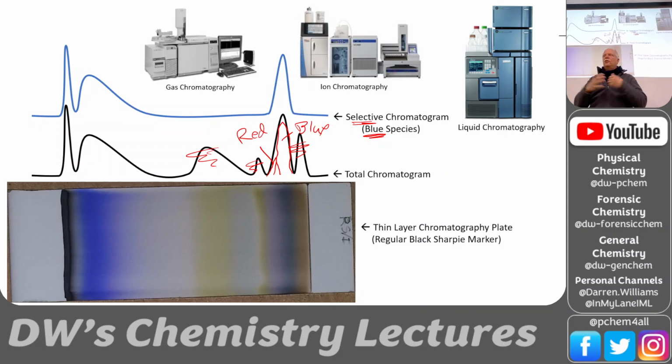Let's say we're doing liquid chromatography and we don't derivatize it, and it's very polar. It gets on a polar column and it just sits there. Okay, and we've got an organic solvent going through, and we flush all the organic molecules through the stationary phase, and then when we're ready to get that acid off there, we start blending in more alcohol or something more polar. And now the polar molecules are more interested in the mobile phase. So they start spending more time in the mobile phase, and then they get drug out.